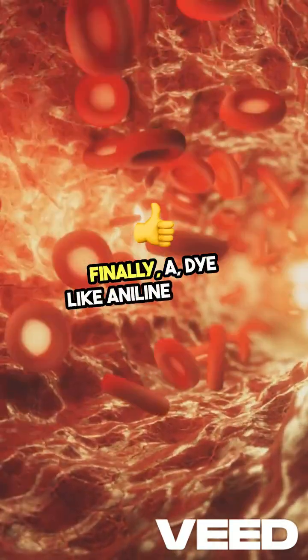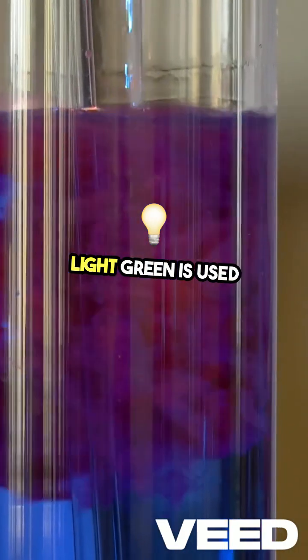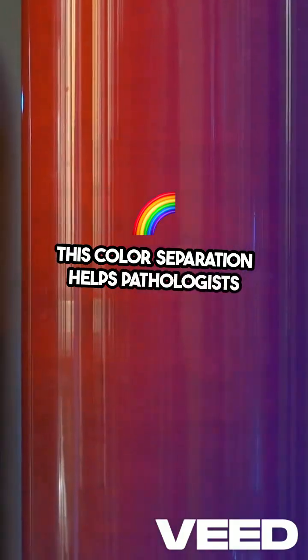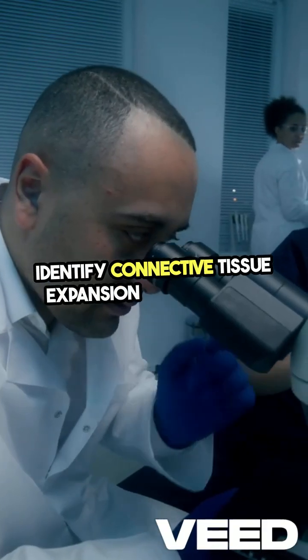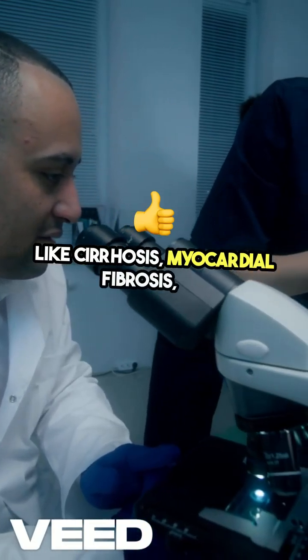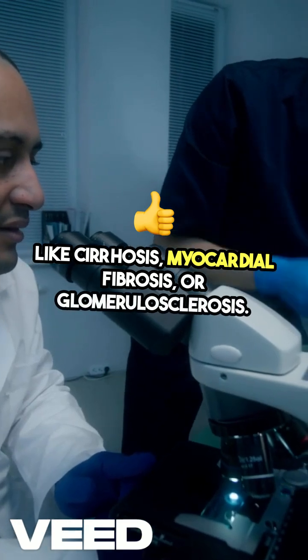Finally, a dye like aniline blue or light green is used to stain collagen and connective tissue, creating a vibrant contrast. This color separation helps pathologists clearly identify connective tissue expansion in conditions like cirrhosis, myocardial fibrosis, or glomerulosclerosis.